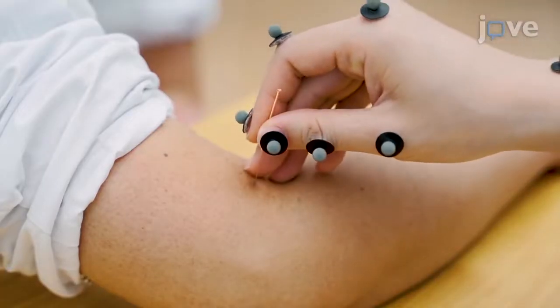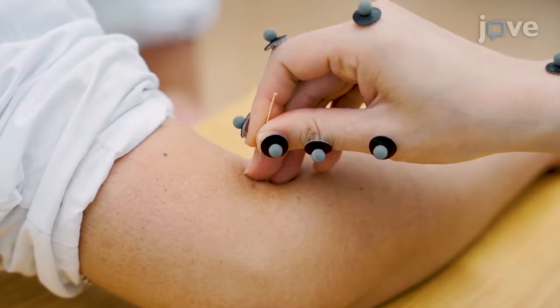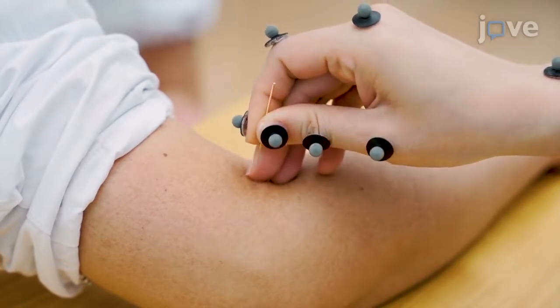This experimental method provides a solution for the stimulation amount determination of manual acupuncture and the quantitative evaluation for the teaching and learning of acupuncture manipulation.